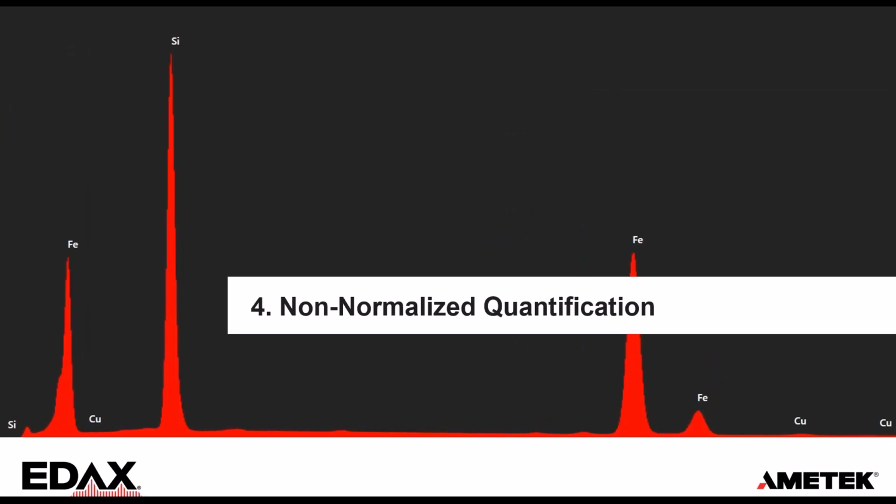As we just have discussed, the normalization condition can do quite some good, quite some bad. So let's see what we can do with non-normalized quantification to overcome the disadvantages if we misidentify elements.